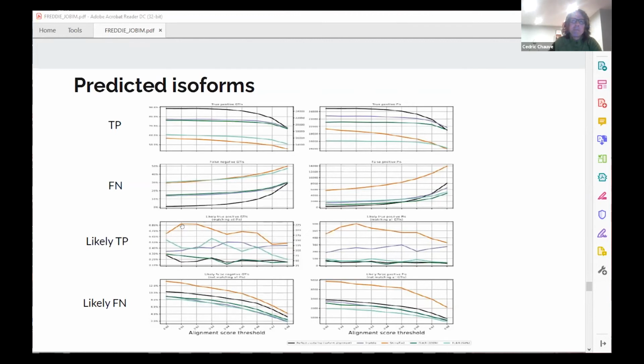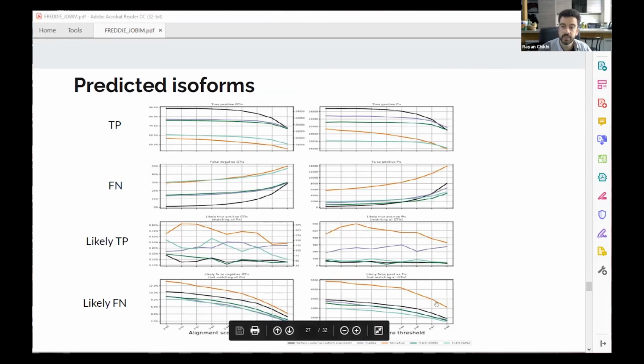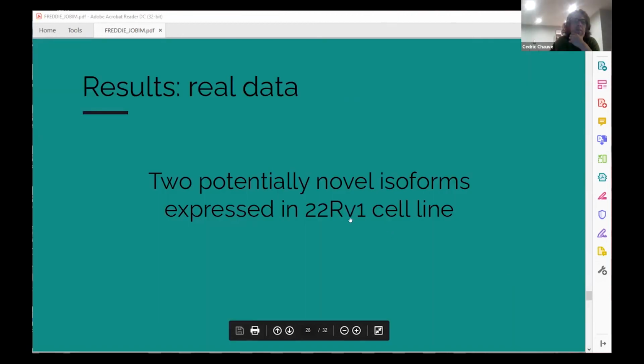Excellent, thanks. A question from Nawal Mansouri, who asked, hello, which data was used to perform AR isoforms? It was the 22RV1 cell line. Yes, that's a good point. Oxford Nanopore sequencing of the 22RV1 cell line, and it was not direct RNA, but cDNA transcriptomic sequencing.